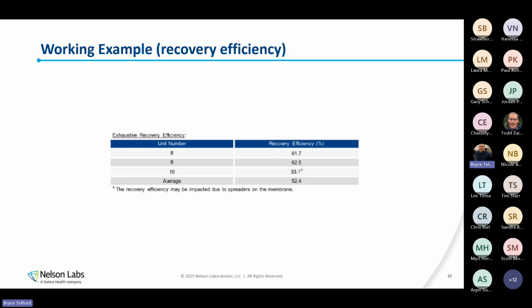And that might be a good time to repeat the recovery efficiency and compare to your data. Did it affect the recovery efficiency? Did it not affect the recovery efficiency? And then kind of proceed forward from there. But generally, to kind of answer your question, quick summation: assess it during the validation and then assess it again if there are changes to the product. Okay.